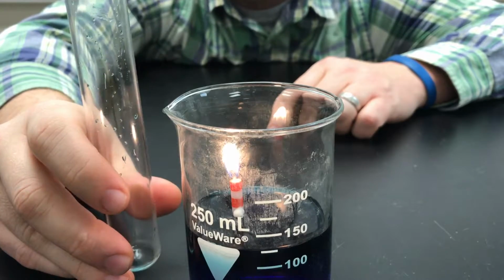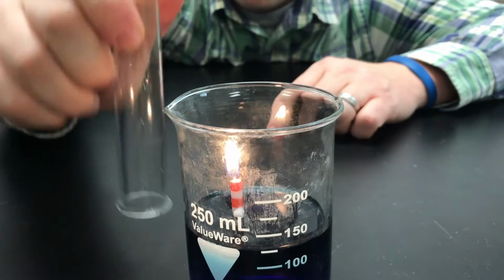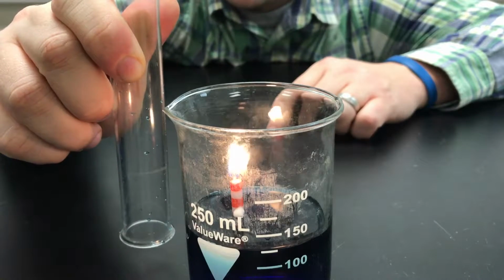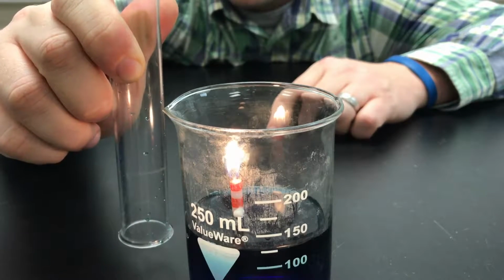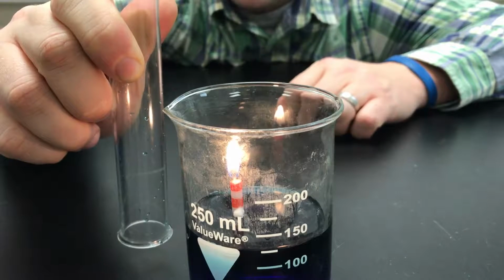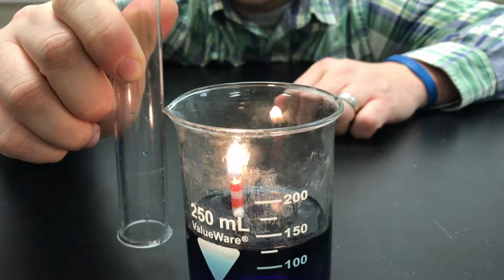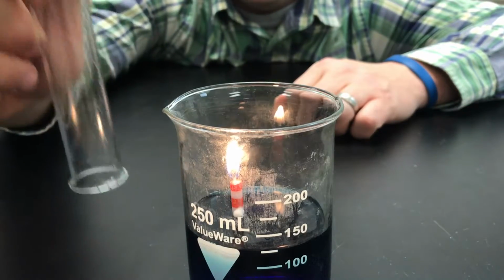To do that, I'm going to take the test tube, flip it over and put it right on the flame under the level of the water, so I have to do it quickly, but not all the way to the bottom. And what should happen then is the flame will consume the oxygen and it should go out because it won't have any oxygen left. So let's do it.